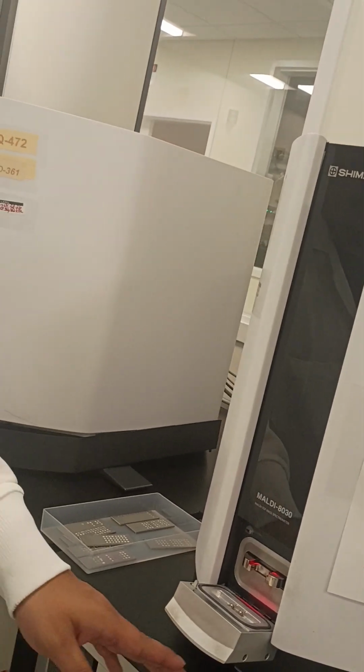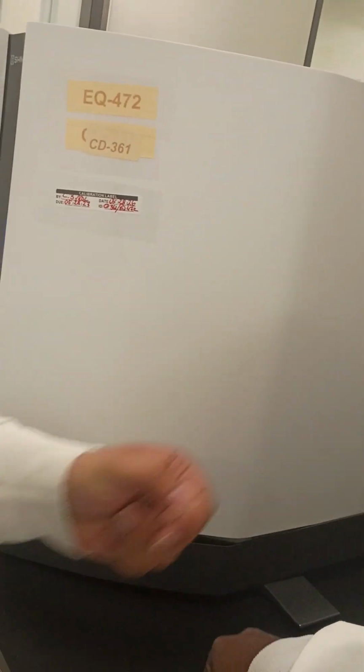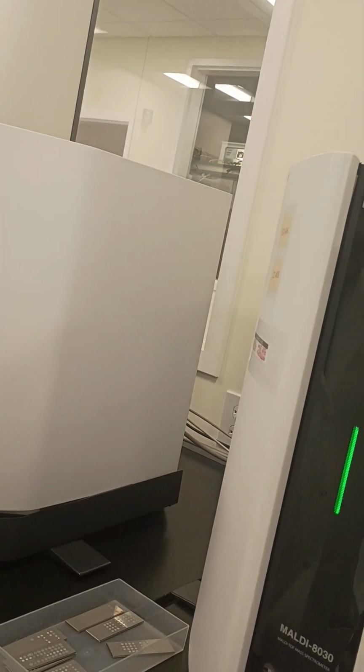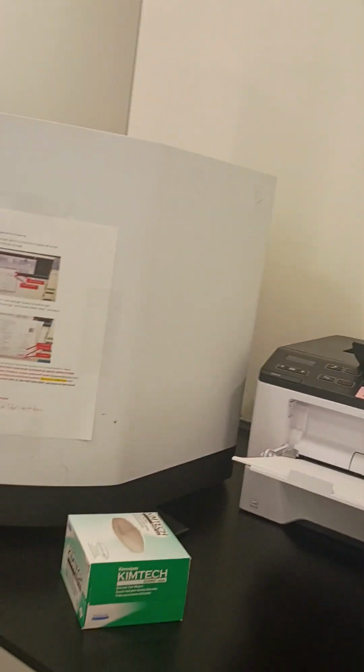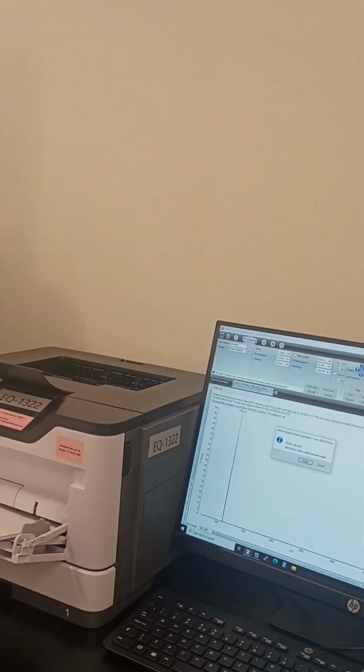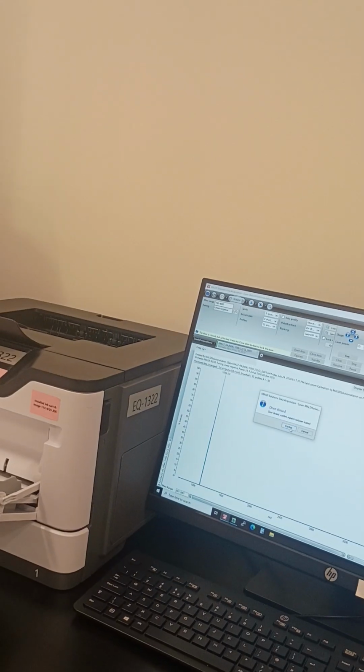And how do you know if there's a plate? You just pull it out. This thing right here goes in here, the one that sticks out. When it's ready, just take it off. Then when you click, you come to the computer, and the computer is going to give you the go to close the door, because it's not really closed right now. You confirm, and then it's going to close the door.